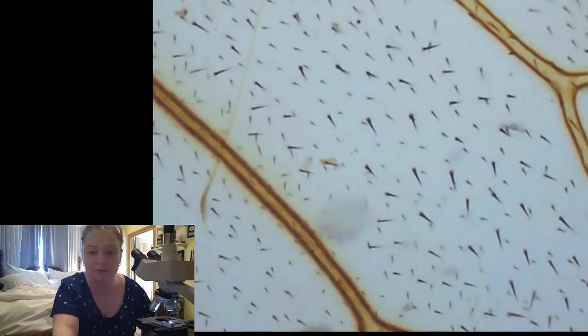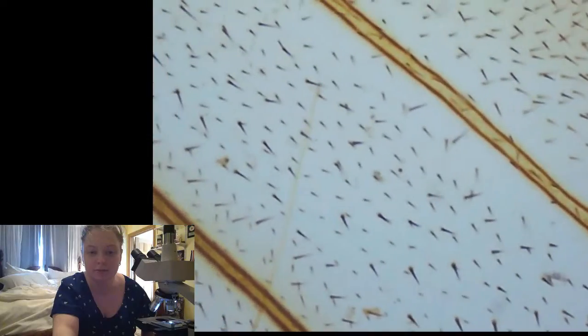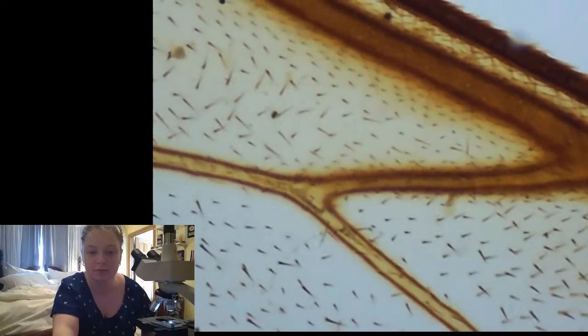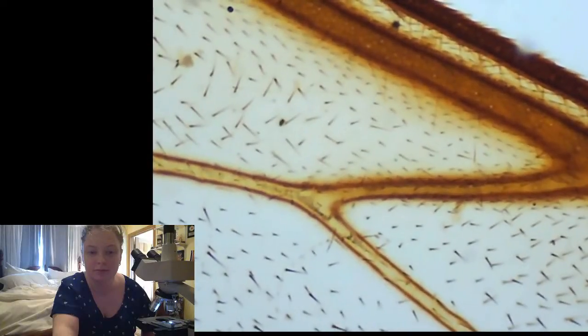I am obsessed with this bee wing. Oh, look at the edge here. It almost looks soft.